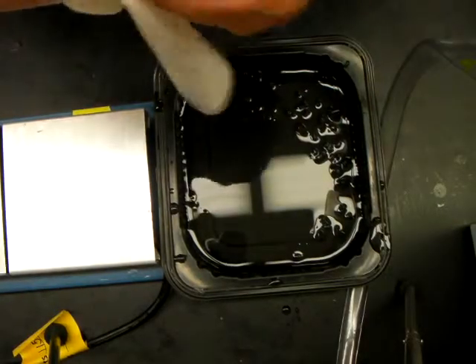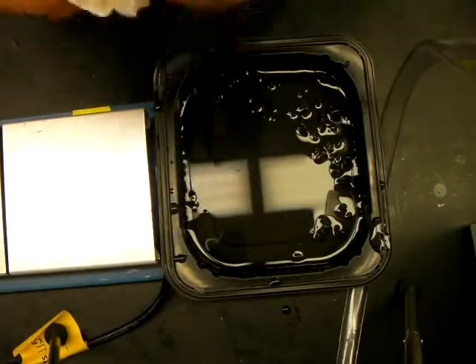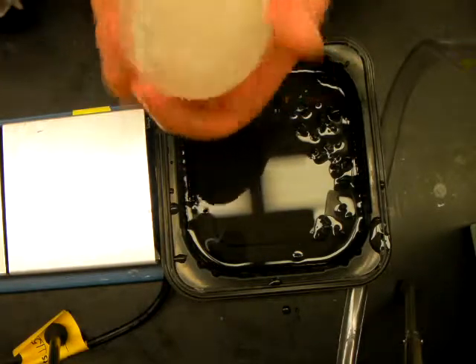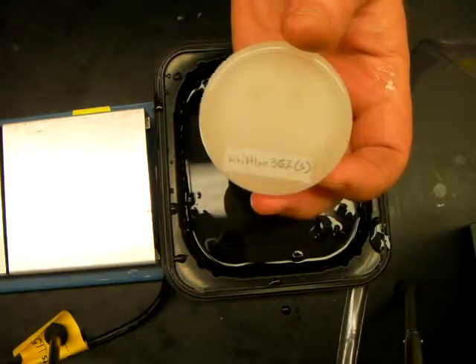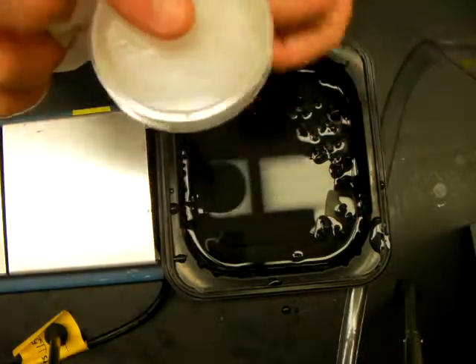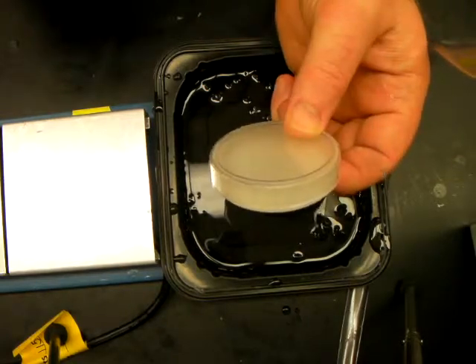All set and ready to go. Go ahead and give it a swipe with a kimwipe to dry it off. There's your label on the bottom to identify what the specimen is — throw a lid on it and you've got your specimen embedded in wax, all ready to go.